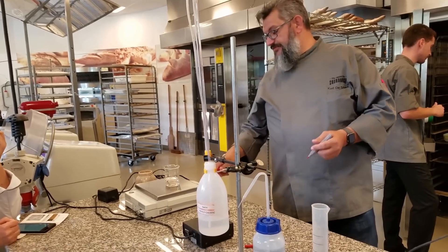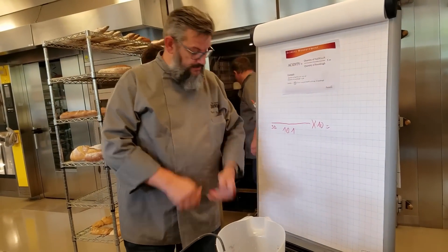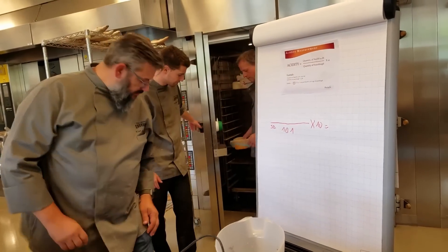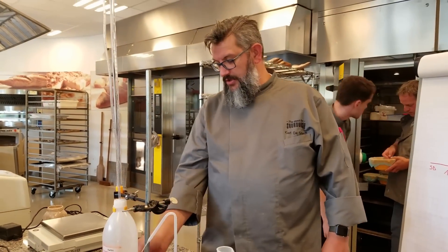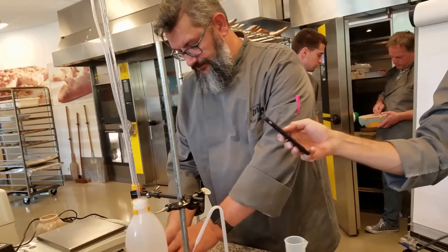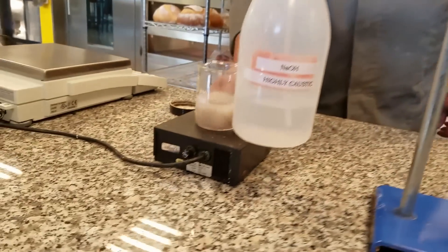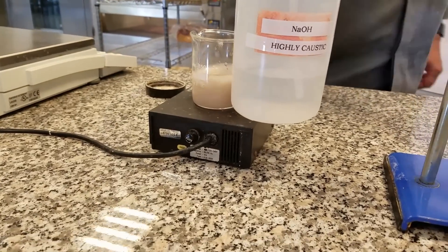So I'm writing down, I have 10.1 grams of sourdough. I'm going to start stirring. I'm going to add the remaining water.